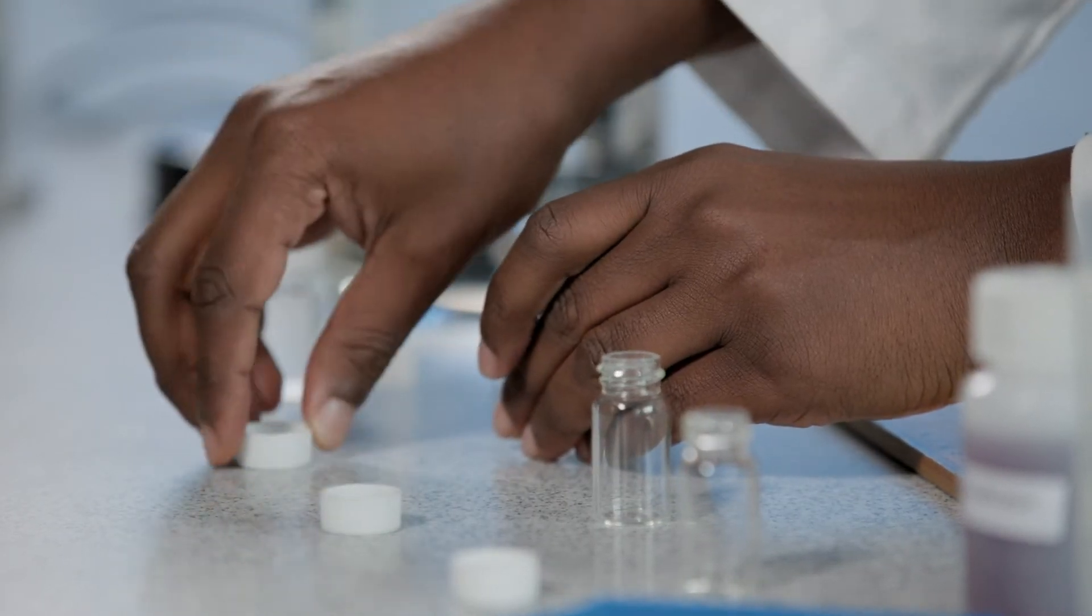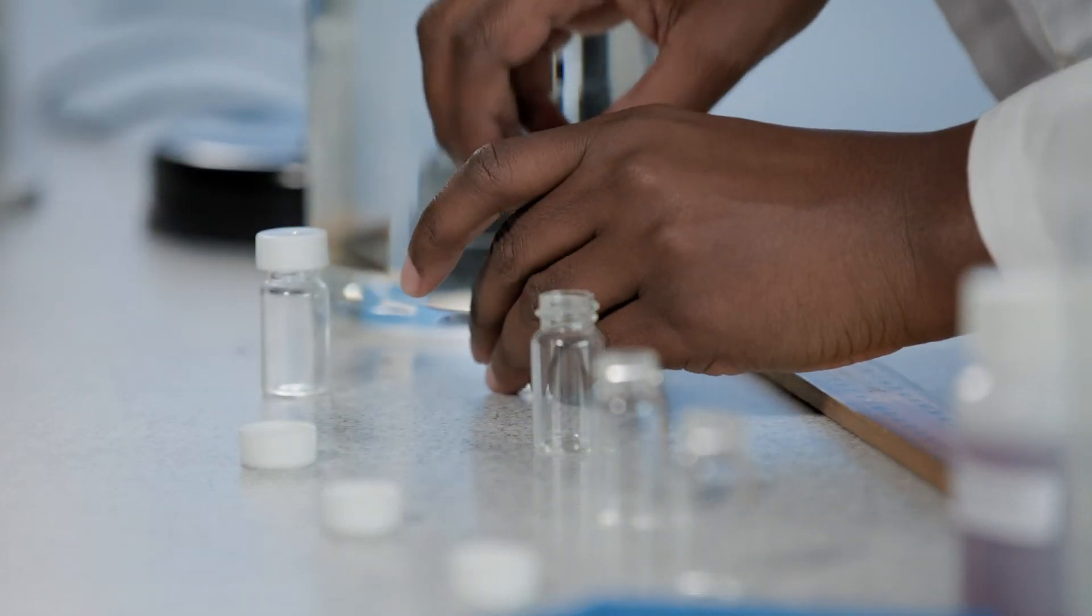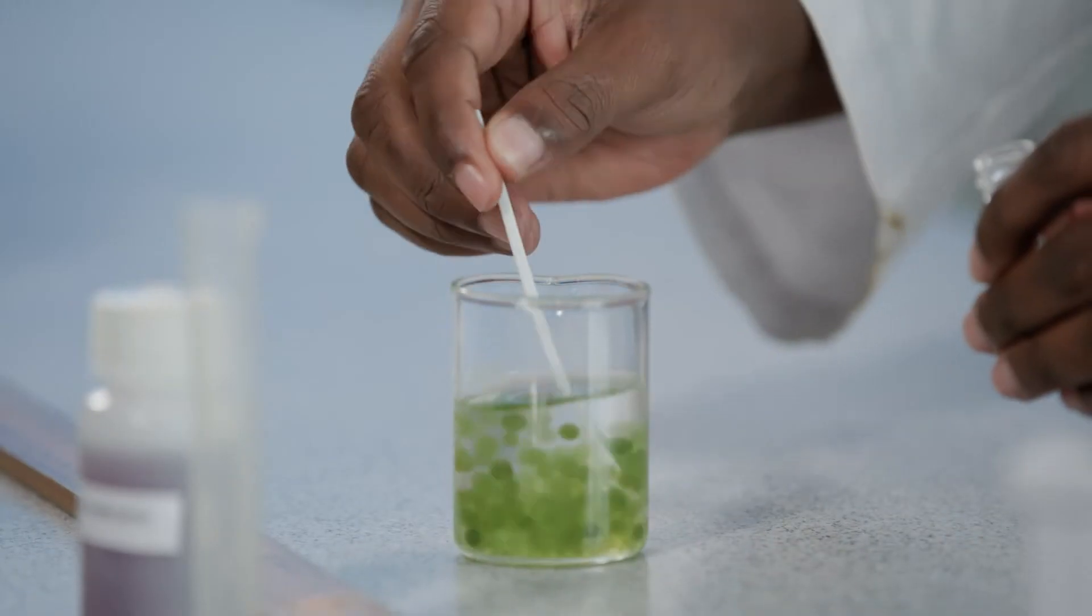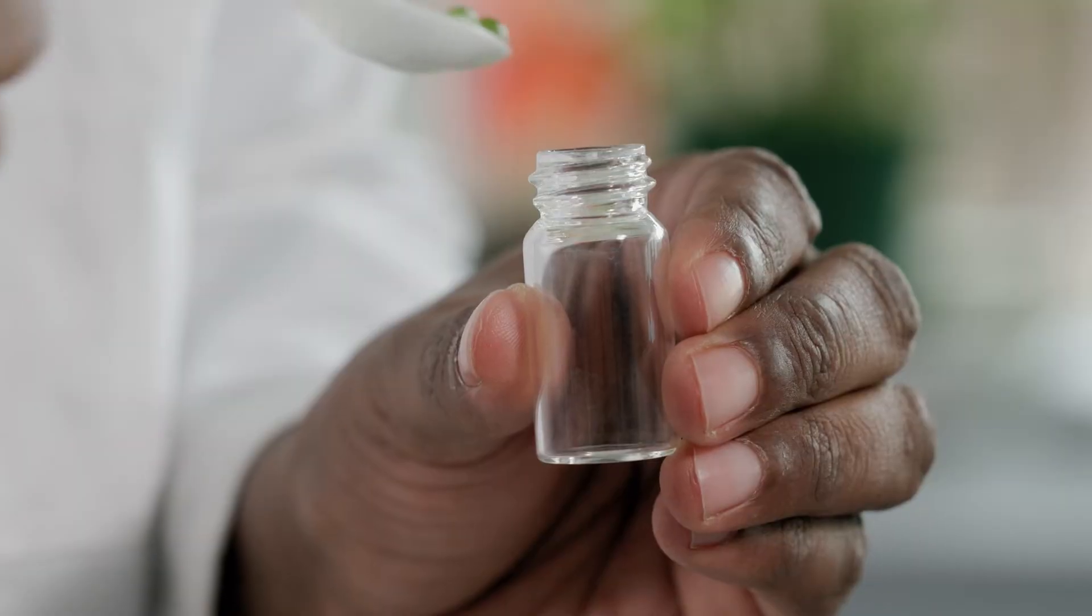Place your bottles at measured distances from the lamp. Remove the bottle caps. First, add 10 to 15 algae balls to each bottle.